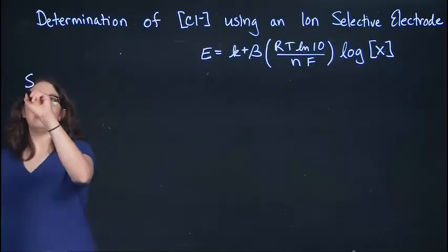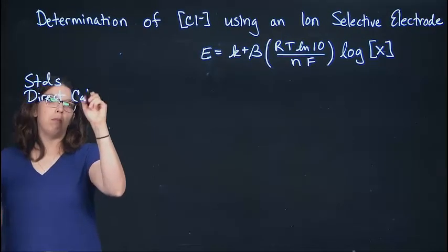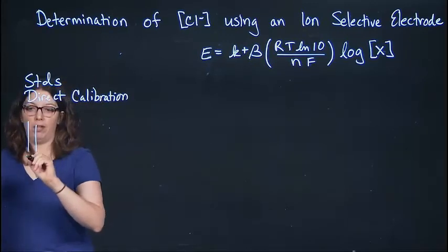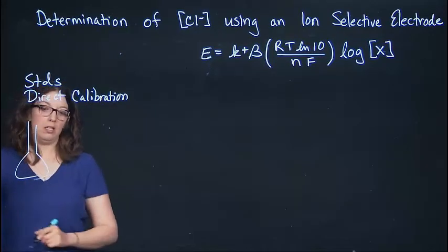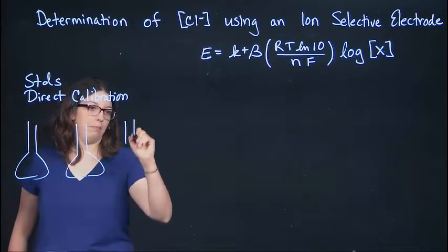So your standards for direct calibration need to be prepared in volumetric flasks, and the easiest way to do this is with serial dilution.